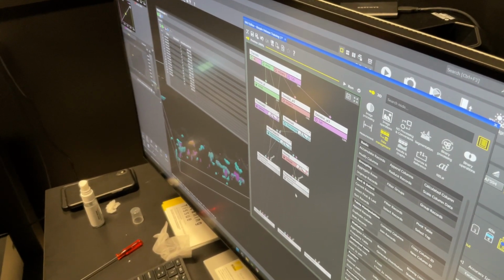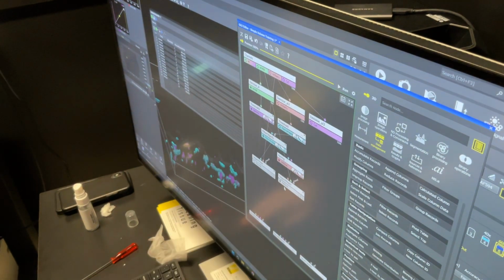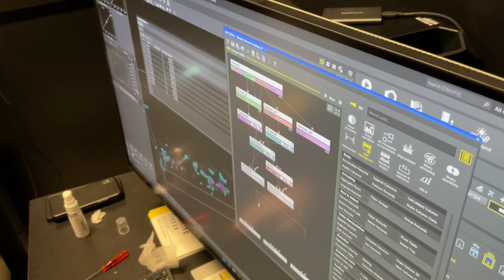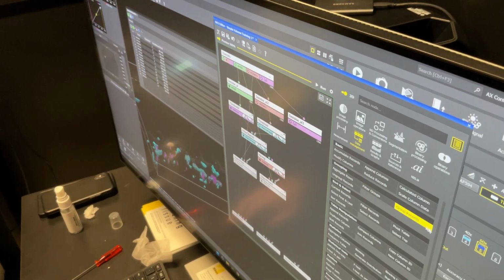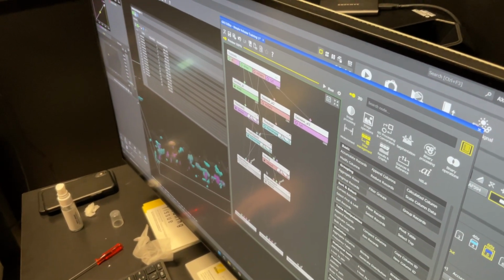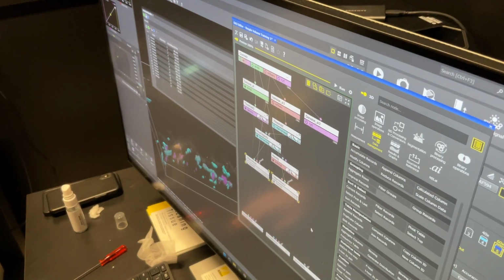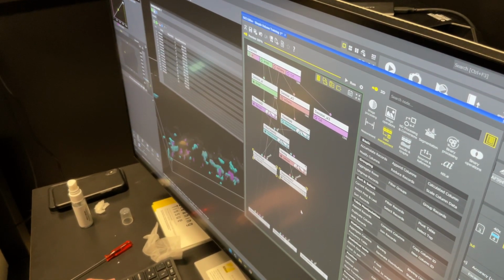There's like 100 different ways to tackle it. Yeah, that's what I did in Imaris. I made this object and then set a threshold saying if it's above this GFP, I'm gonna say it's infected, and if it's below, it's not. Well, we could definitely do filtering records or grouping records, things like that. There's a lot of different things we could do. Because this is getting very close to a parent-child relationship, but it's not.